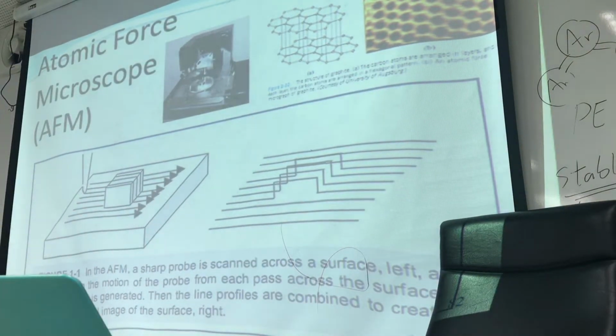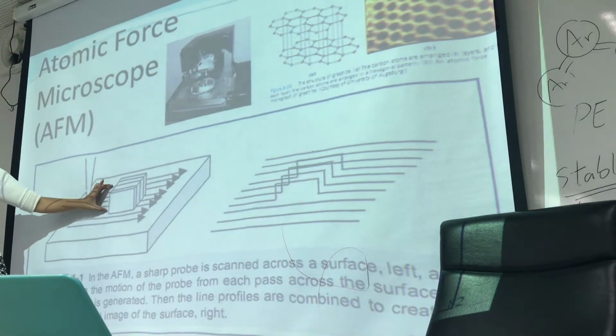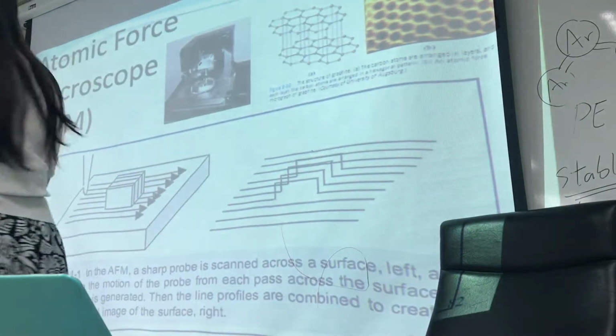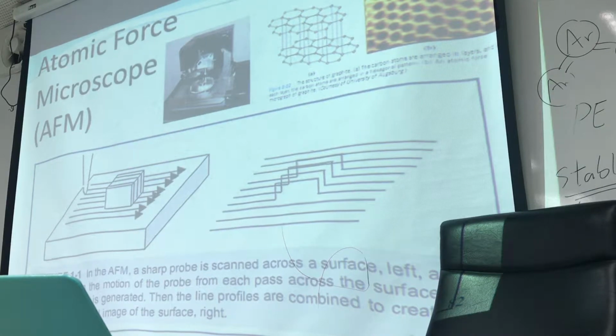So this is the way it is. Just scan through it. If that is the bump, you see that? It will come out like that. Right? And if you take a look at the picture that comes out, it looks pretty much yellowish, orangish, like that. You can guess that they are scanning probe microscopes, right?